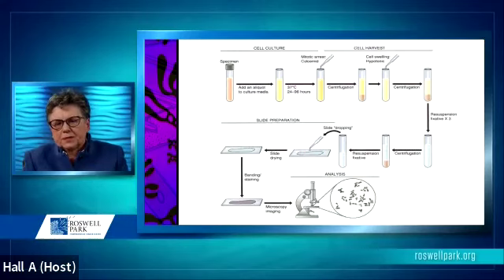There are several steps. The first step involves cell culture. The second step involves harvesting. There's a slide preparation step, a banding step, and an analytic step.